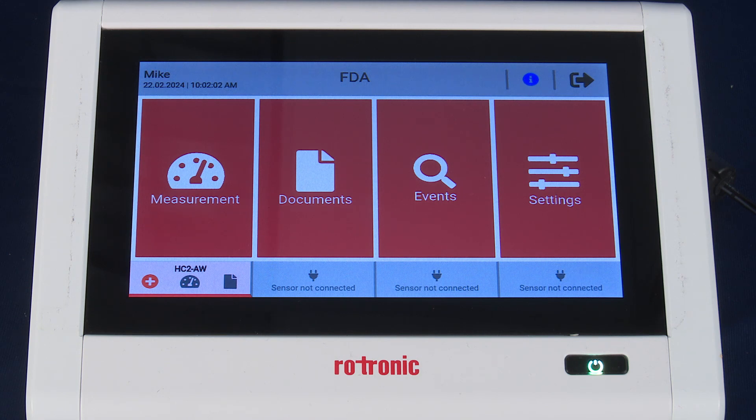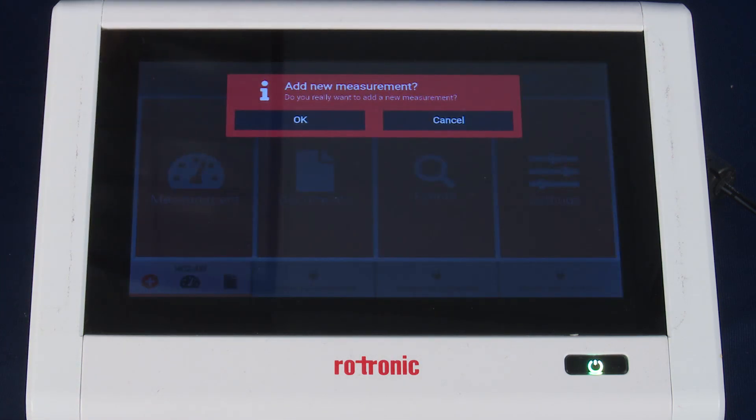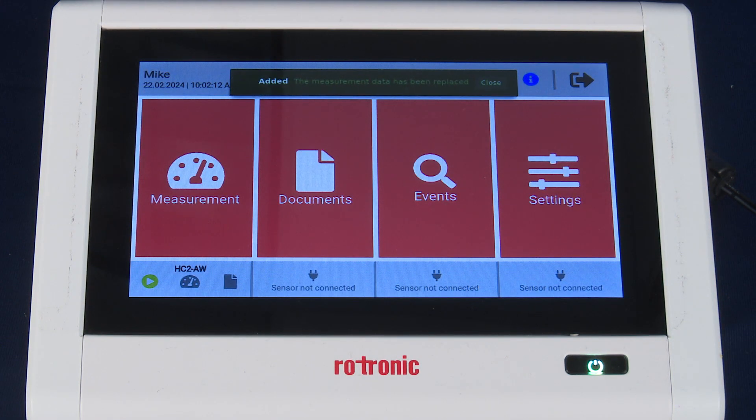From here, we want to start the process by adding a new measurement. You can do that by pressing the orange plus icon in the bottom left-hand corner of the screen and acknowledge OK. The green bar indicates a successful new measurement has been added.